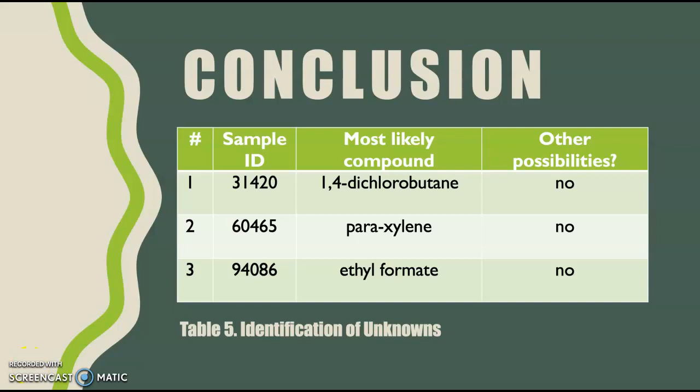IR and NMR spectroscopy are valuable tools to use when identifying pollutants in contaminated water samples. They highlight the functional groups, number of peaks, and ratios of areas. This data led to being able to definitively tell what each sample was, and then research its health and environmental risks.